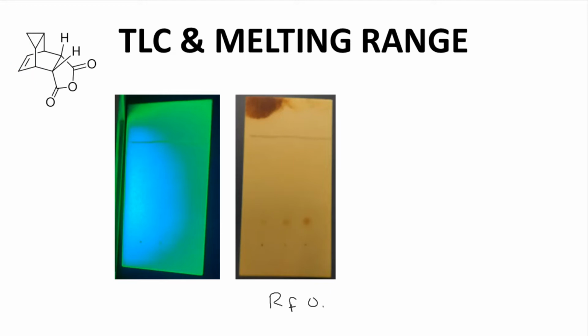The Rf value for the spot is about 0.21, and the mobile phase was 20% ethyl acetate and 80% hexane. The important thing is that we only see one spot in each lane, which is a sign that our product is likely pure. The only difference in the three lanes is the amount of material I spotted.